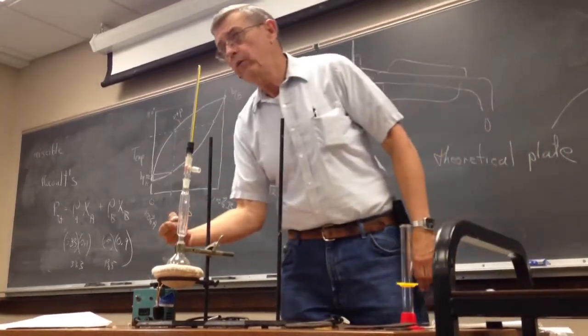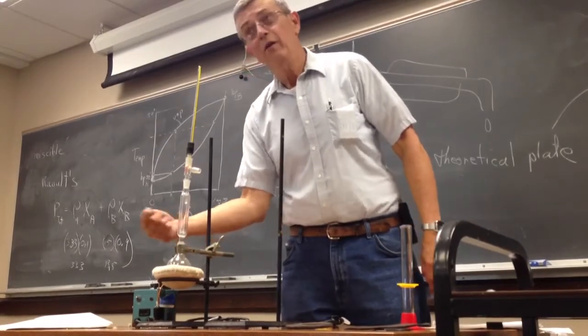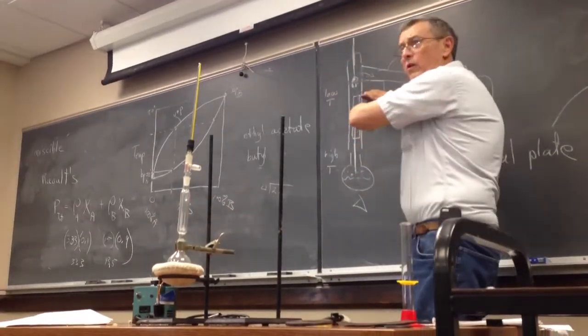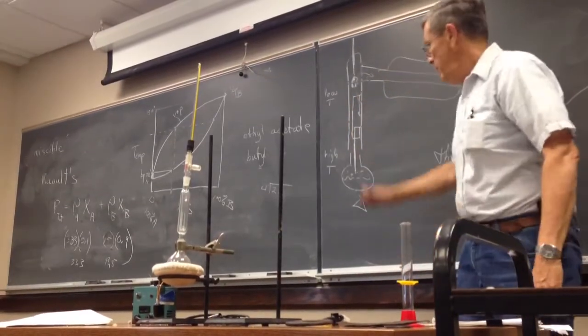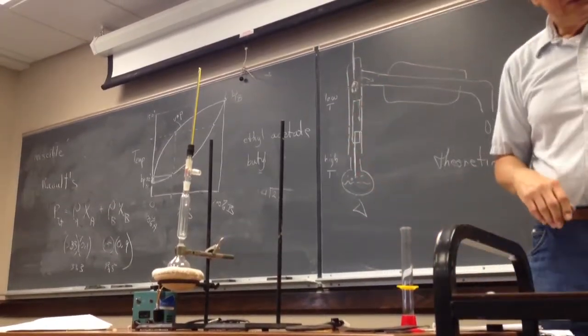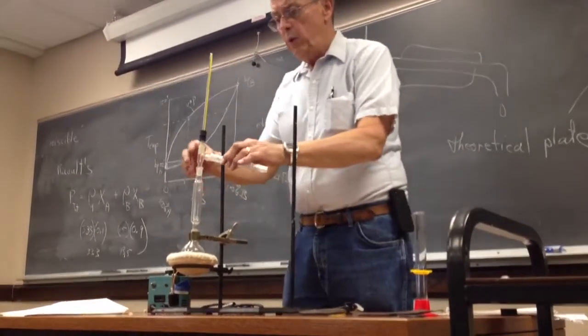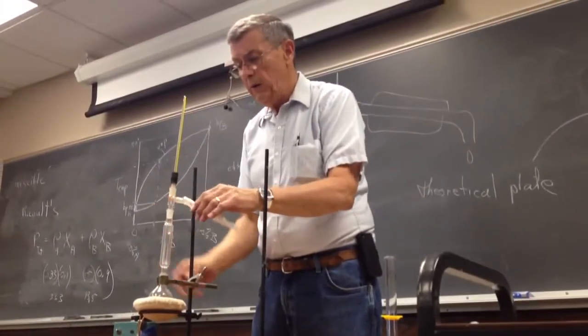No water going through this. If I did, this whole thing would be at room temperature. I don't think that's what I want. Right? I want this gradient. So I need a condenser to put on here. That'd be this one. Put it on now. Whoa, wait a minute. Gravity.